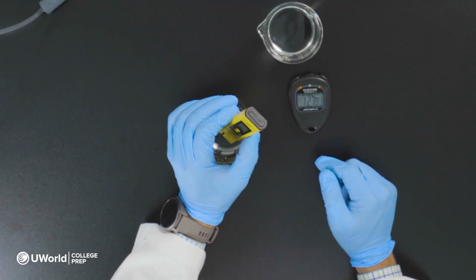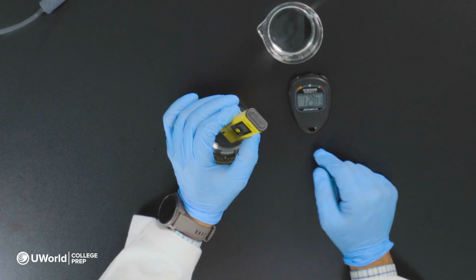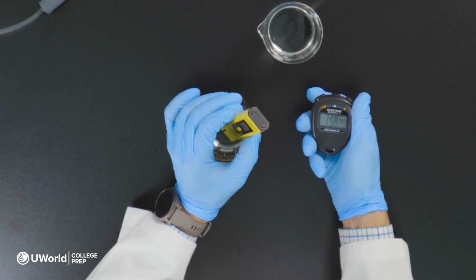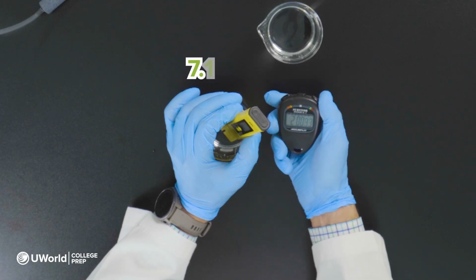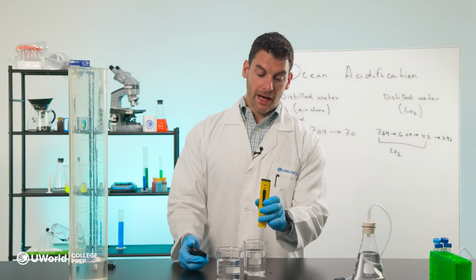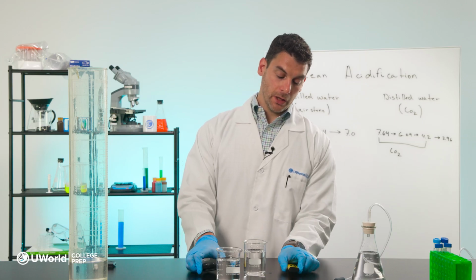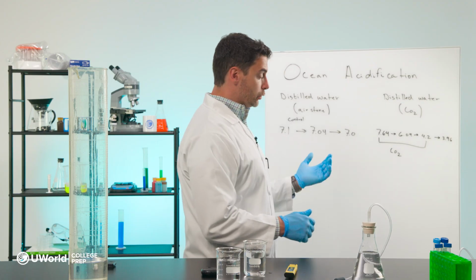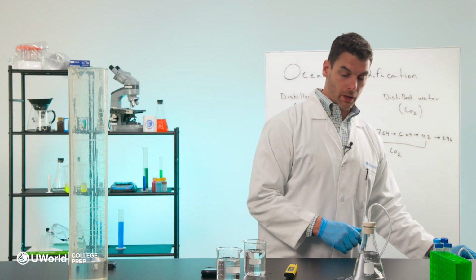And at a minute 30, there's no change in pH. And again, here at about 2 minutes, we're still at 7.84. Not a whole lot of change happened with our air stone, which is what is expected. What did happen though is our pH is a little bit higher for our ocean water.